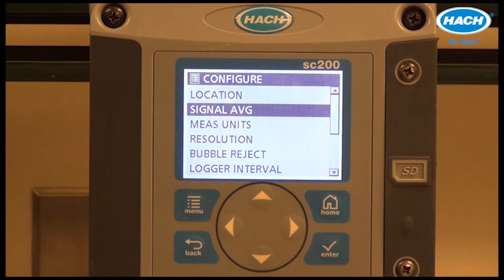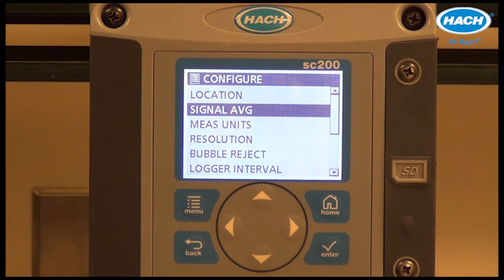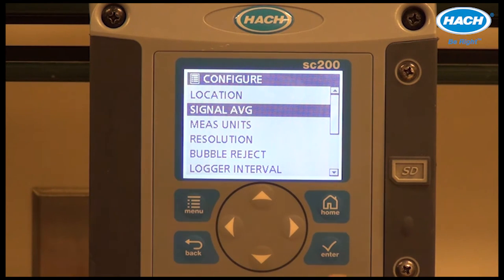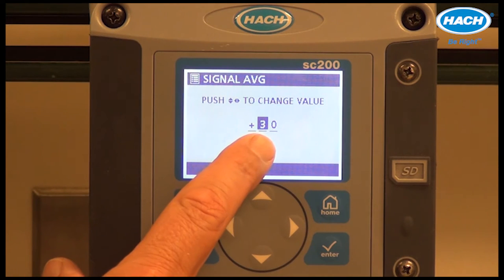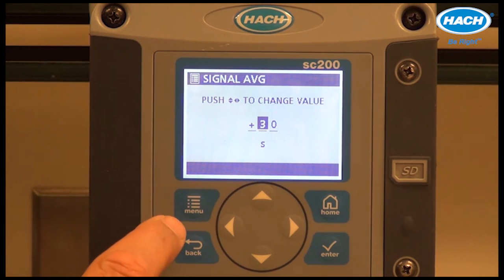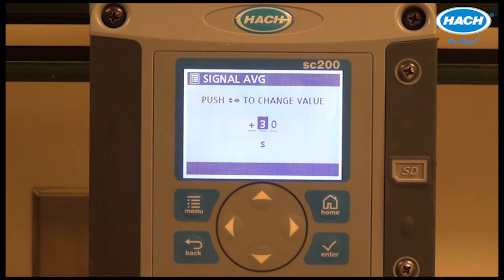Signal average is a feature that mathematically averages readings from the TU5400 or TU5300. The signal averaging default is 30 seconds and can be set anywhere from 5 to 90 seconds.